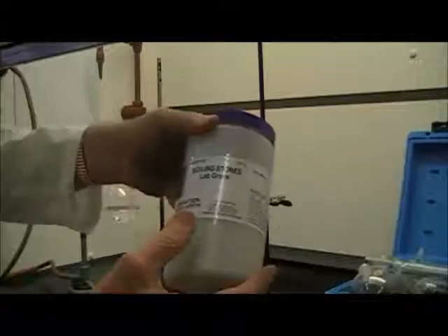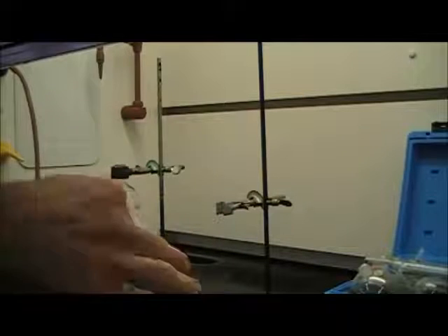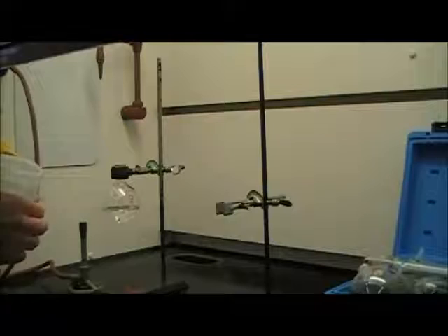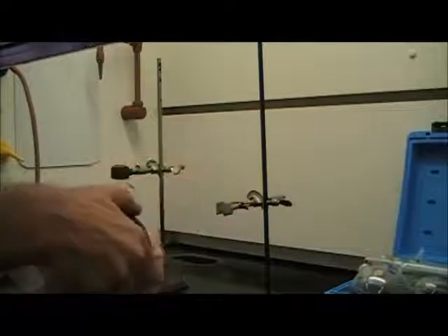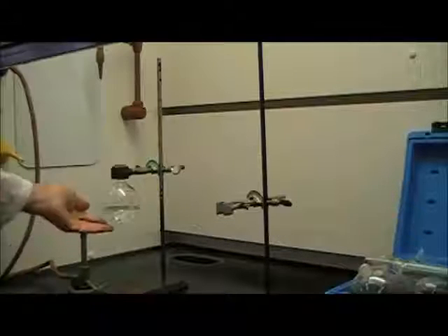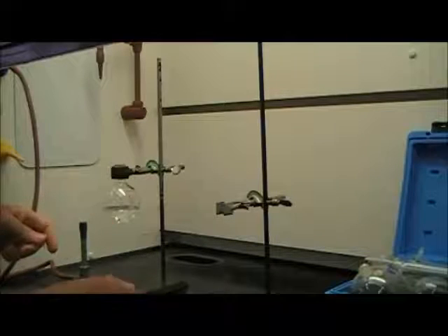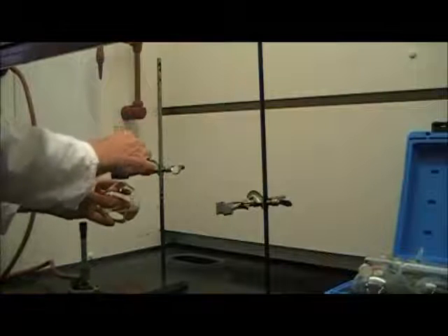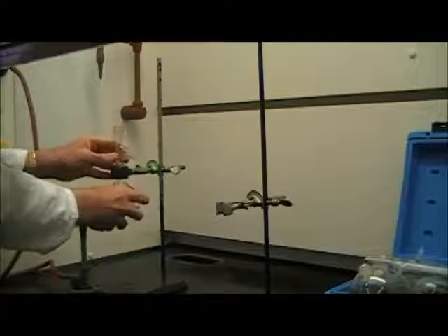I'm also going to add some boiling chips. These are little pieces of porous material that don't react with the solution. They just serve as jagged surfaces for bubbles to form on, so that the boiling occurs smoothly. So I put my liquid in, I put some boiling chips in. I'm going to put the still head on. Notice that the ground glass pieces fit together perfectly, so we don't need to use any grease.